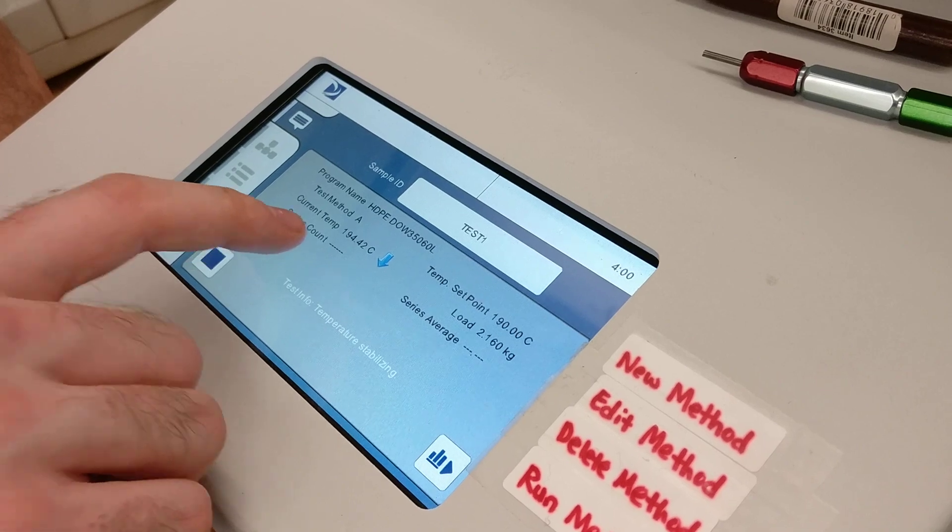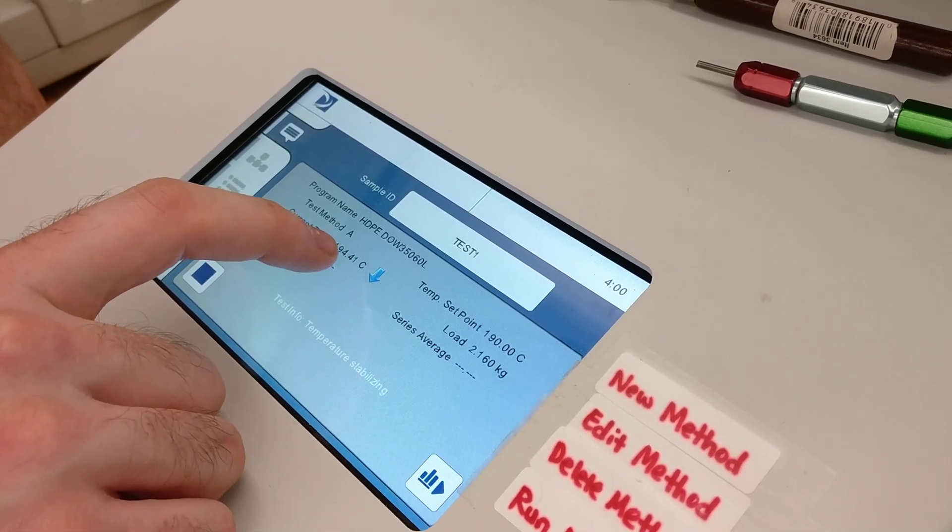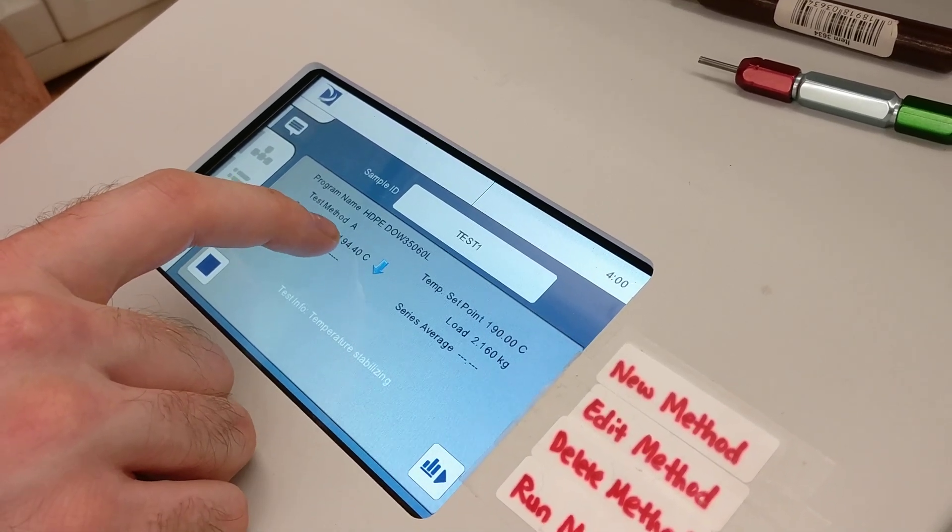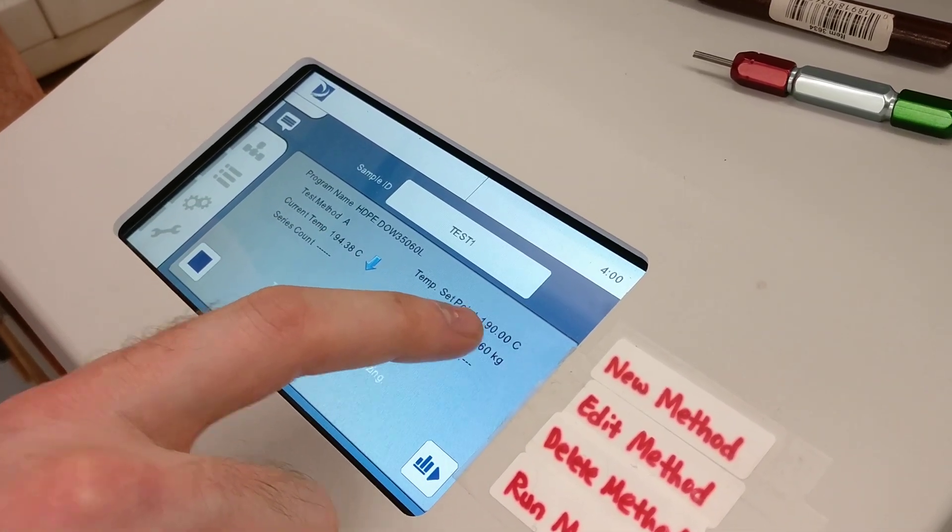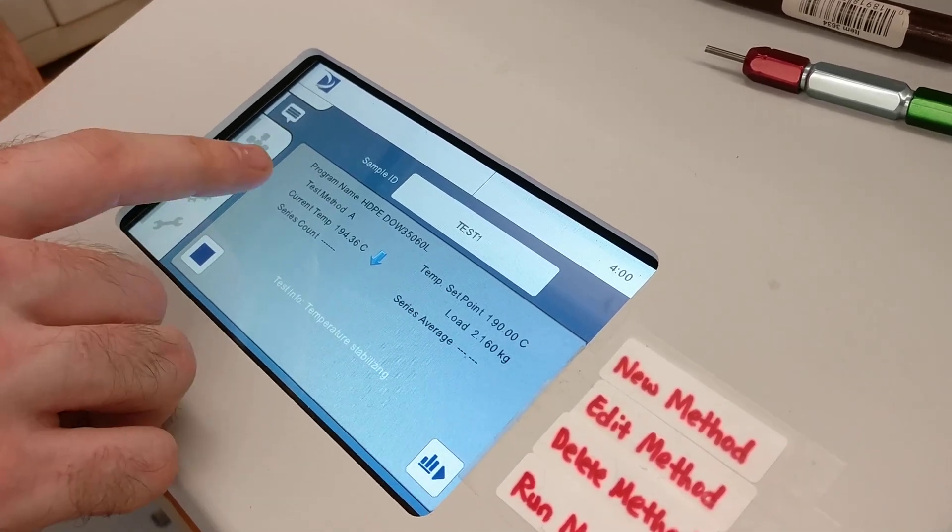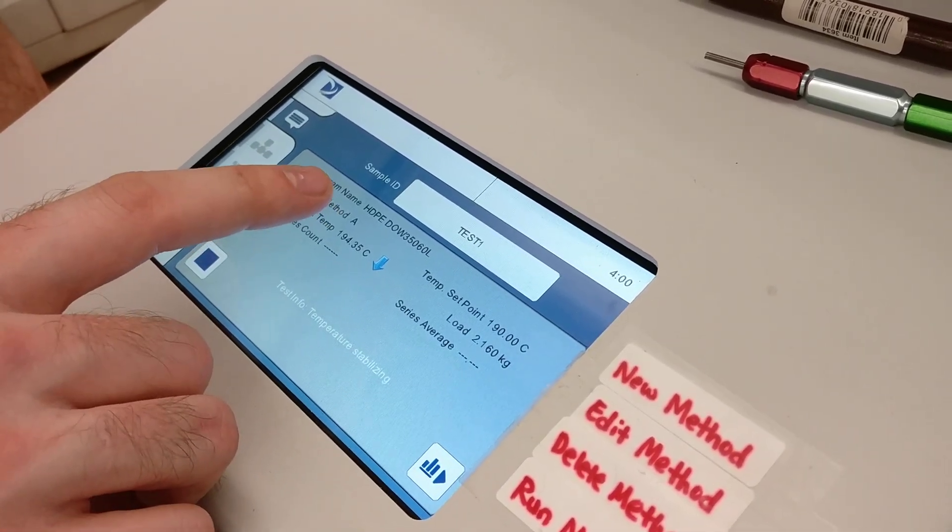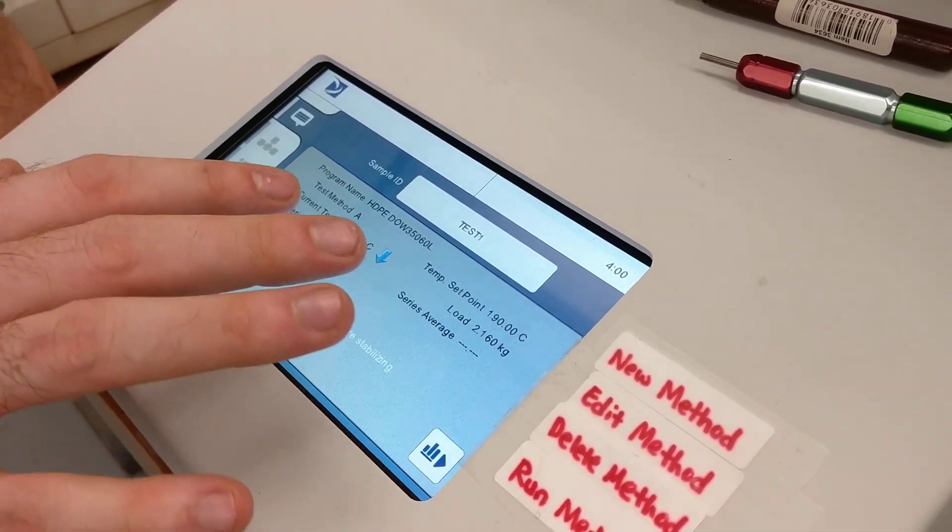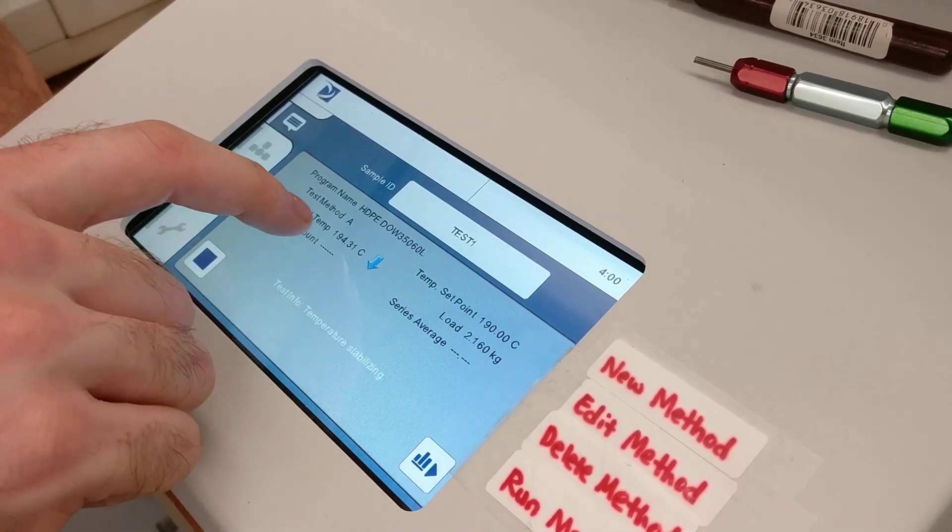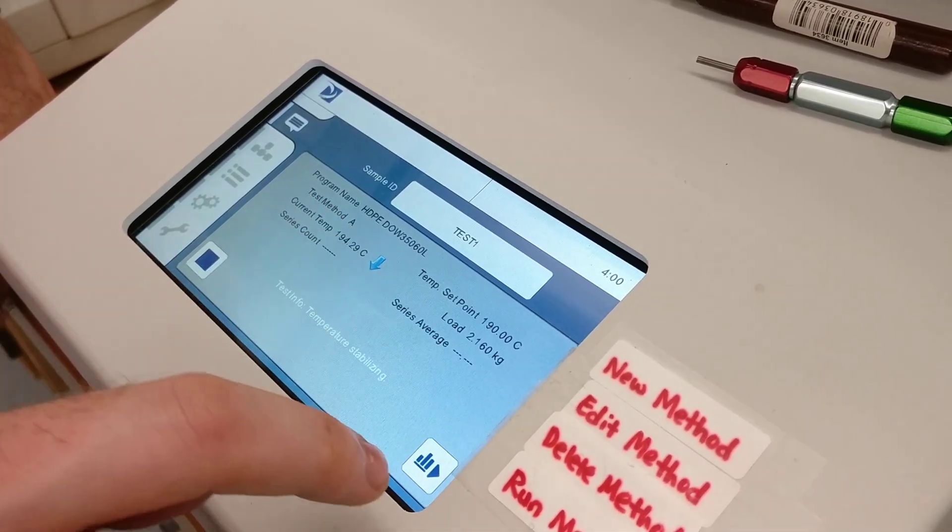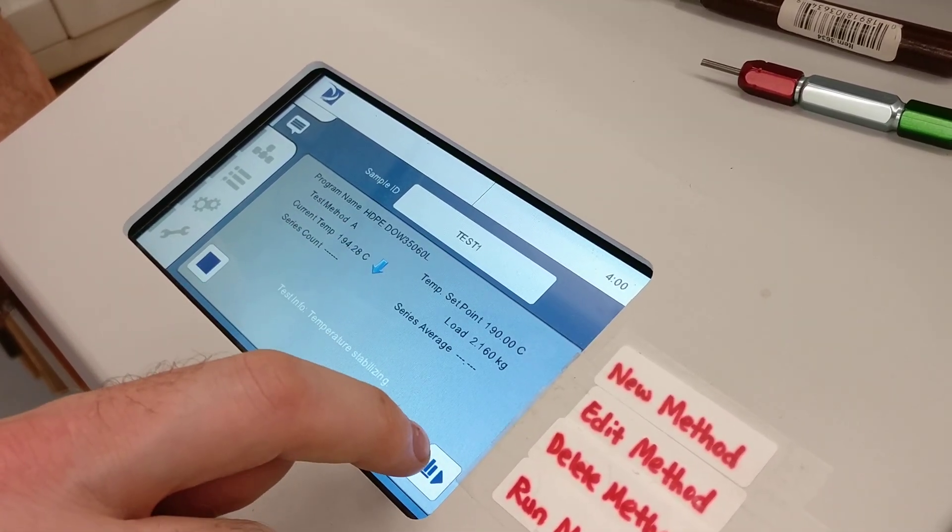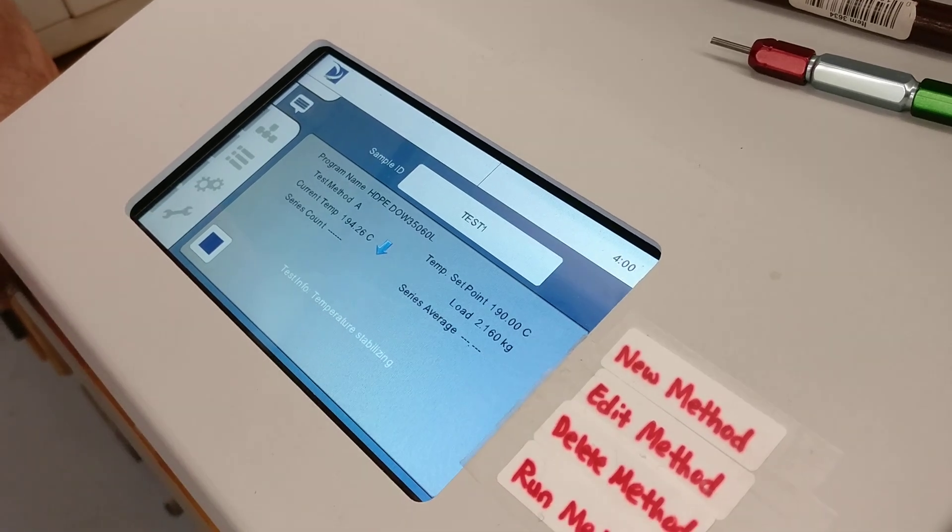The first thing that's going to happen is we'll be stabilizing the temperature at the set point. So it'll probably come up from room temperature. It might take 15 minutes or so to stabilize. After it's pretty close to the set point, we can hit the next button.